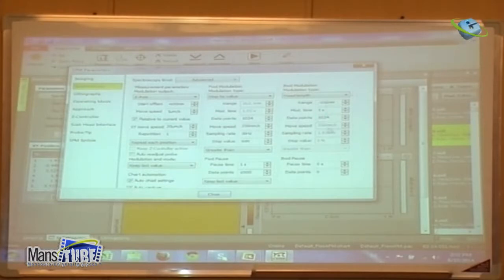Because this is fixed length. For this fixed length, I said just go back 256 nanometers. While here I ask it, when you reach a value of 5 nanonewtons, stop, and then I just go back. I can also ask it to go by force. It depends on me. This is usually how we do it.